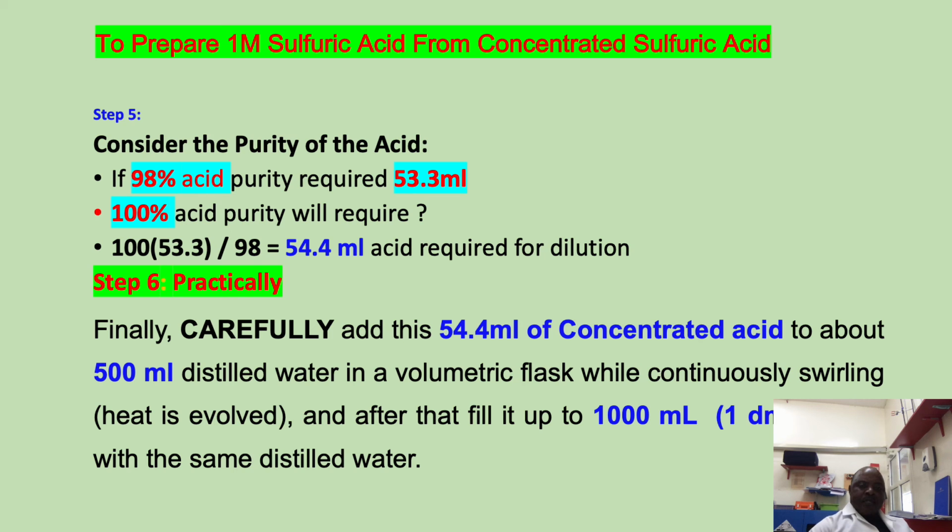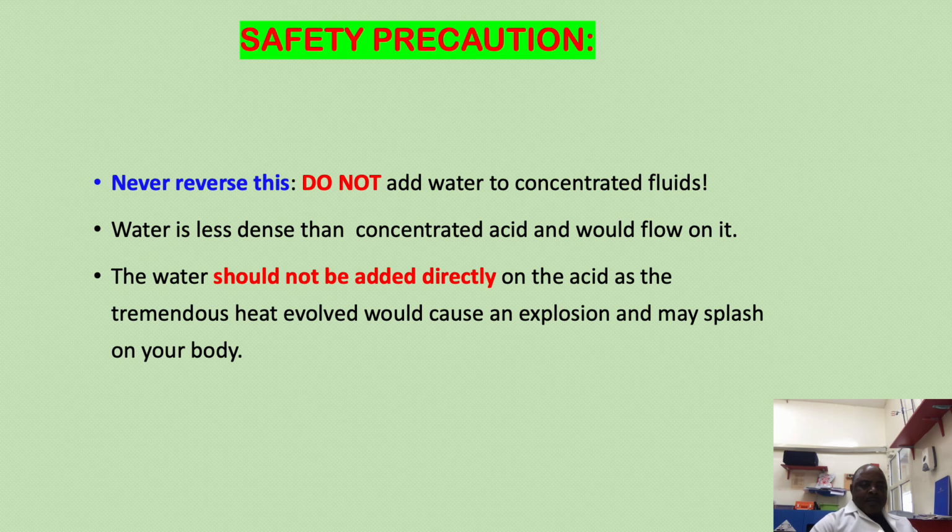Practically, you are going to see how it goes. A lot of precaution must be taken in this. Regarding safety, as I said, do not add water on the acid, but instead we add acid on the water. Then you have to put on your safety goggles and gloves as preventive measures.